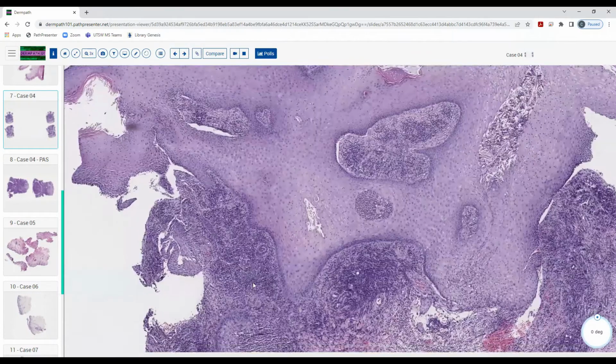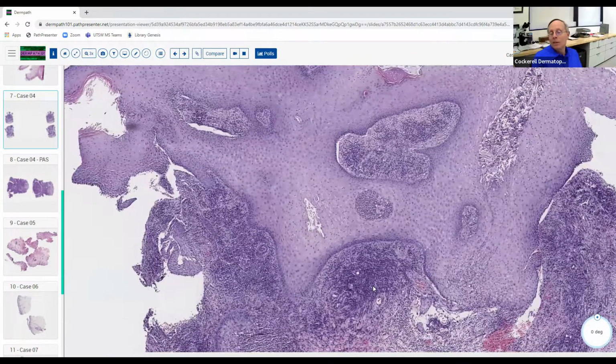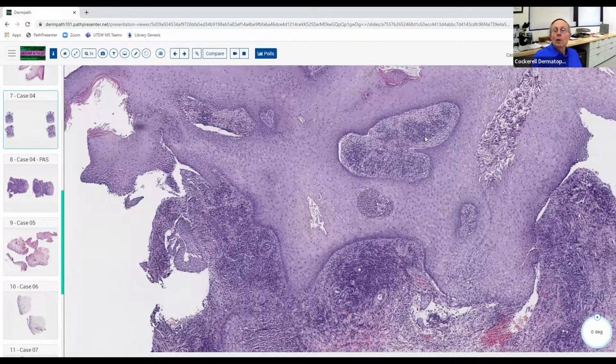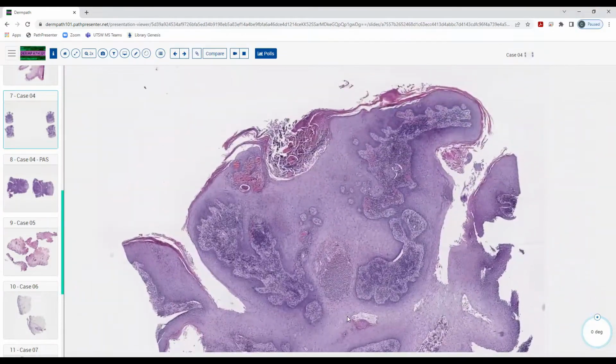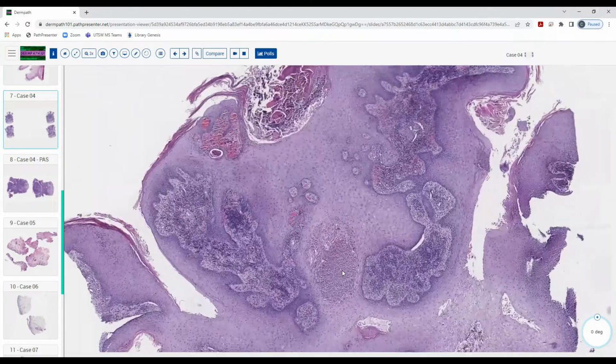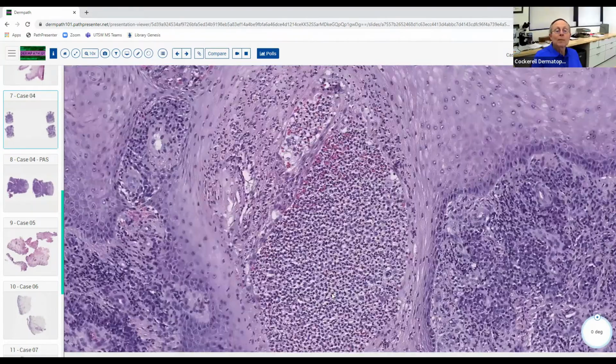Exactly. This is going to be on your exam. You will definitely have something like this on there. They're going to throw this up and say, okay, let's see if they can find the bug. So where do we want to look? I would look in the collection of neutrophils. Good. That's the easiest and best place to look quickly.